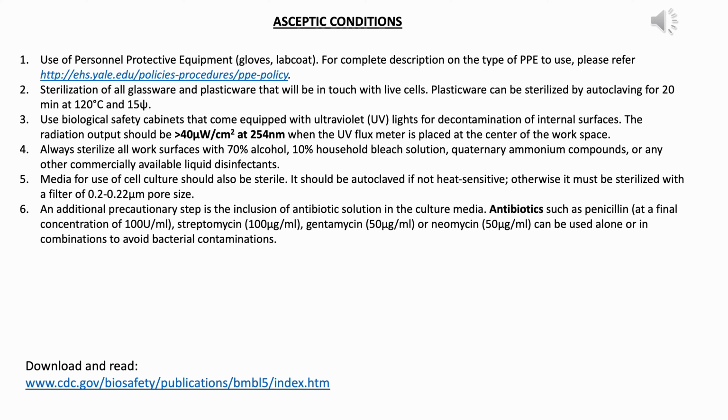Okay. So the workbenches, the outer surface of all the plastic glasswares and the media bottles and everything has to be wiped with 70% ethanol and then only taken inside the cabinets. The water baths and the water tray that is kept inside the incubators, all of these have to be constantly changed and checked whether there is any fungal or bacterial growth happening there. The traffic in the room should be very low. Sometimes there are 20 people inside the cell culture room, which will increase the contamination issues. So the traffic should be very low.